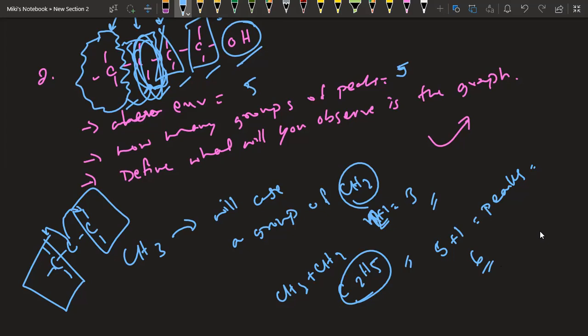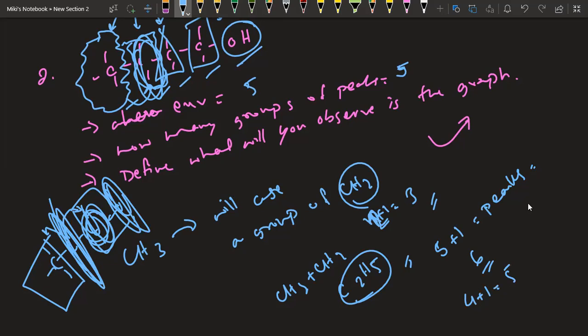Now, coming to the next portion, we have another CH2, and with respect to this CH2, we'll have a CH2 towards its right and towards its left. This carbon's adjacent carbons have 2 hydrogens each. That means 4 total hydrogens, one over here, another over here. So 4 plus 1 goes to 5. That means this is also another multiplet.